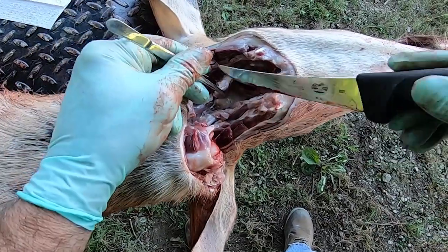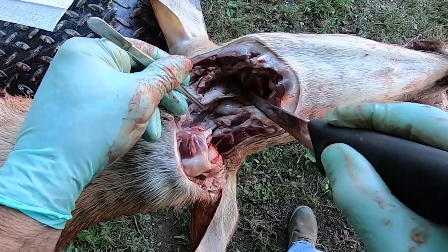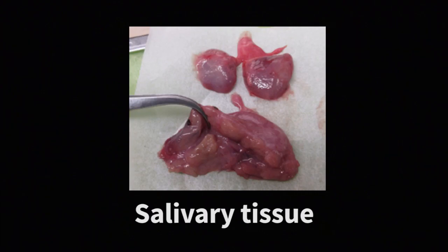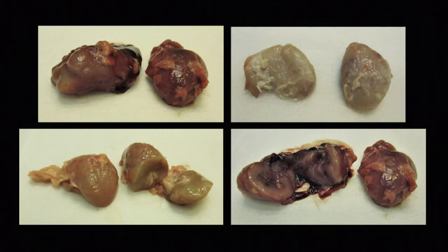Once you make the cut, you will see two oblong-shaped pieces of tissue on each side of the esophagus. Lymph nodes can vary greatly in color and size. Salivary tissue is located close to the lymph nodes and is sometimes accidentally pulled and submitted as lymph node tissue — this will not work for diagnostic testing. Lymph nodes are bean-shaped and look like oysters, and the tissue is firm and retains its shape.